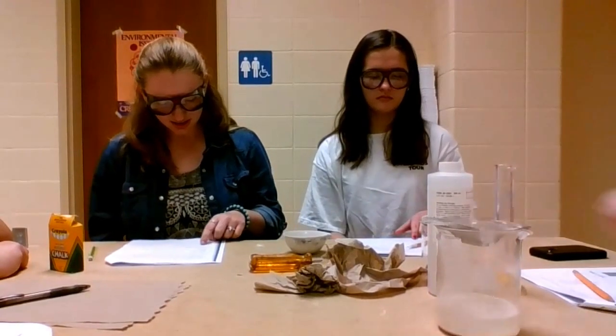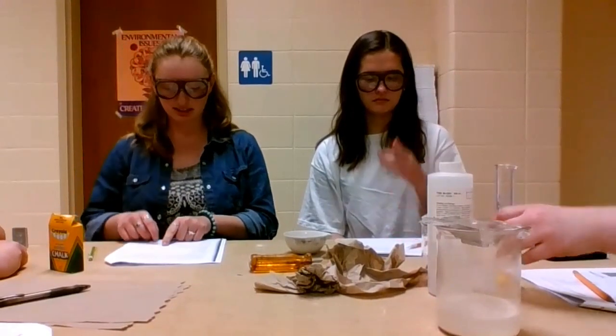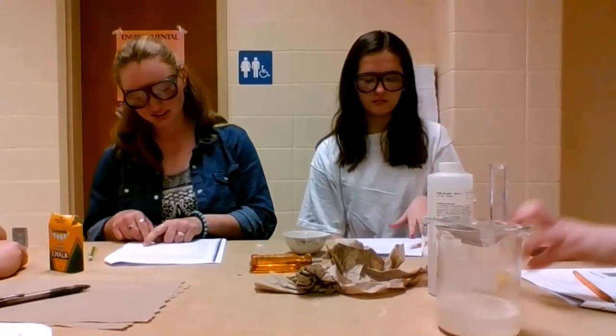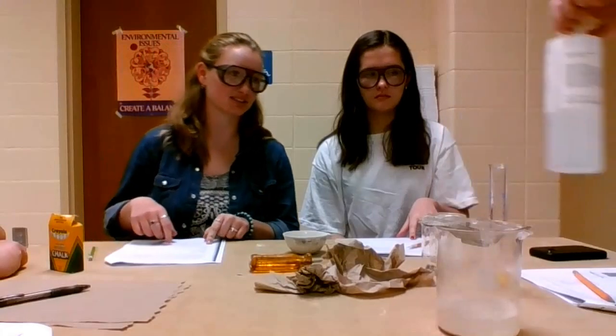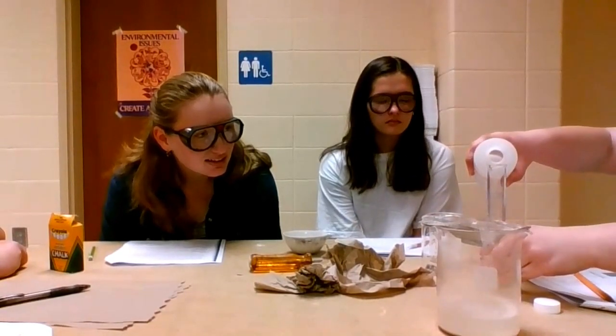All right. Using the graduated cylinder, measure and pour 25 milliliters of the concentrated acid rain into each of the beakers. Sorry, I was talking about that. I completely forgot. Sarah. Oh, my bad.